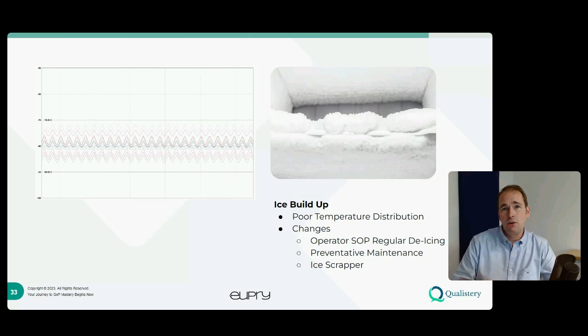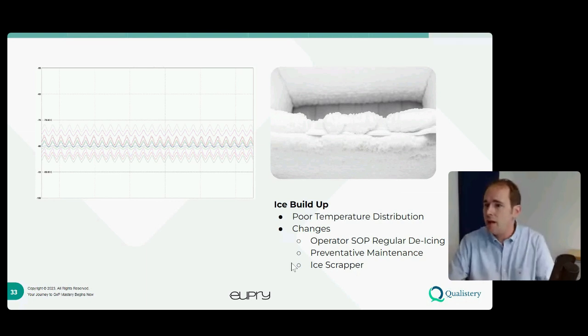Ultimately, door openings causing alarms can be very frustrating in a lab environment where you've got products and units that have been opened and closed all day. So it's about balance. It's about risk to the product. And if it is a big risk product, it's about storing it potentially in a different unit that's going to give you better control. So I'll just carry on with the presentation. We'll take a look at some of the other comments.